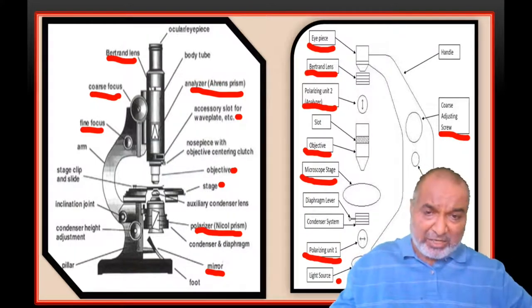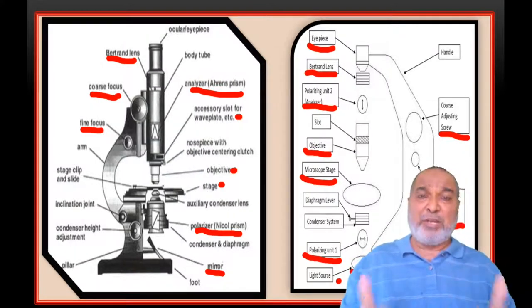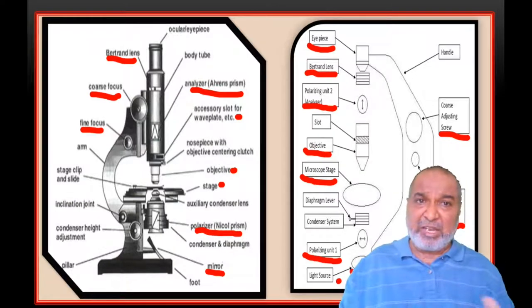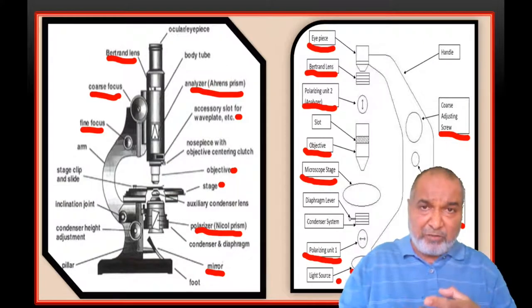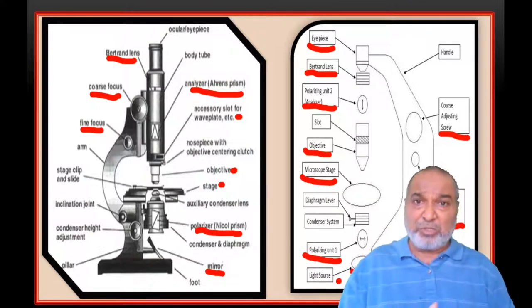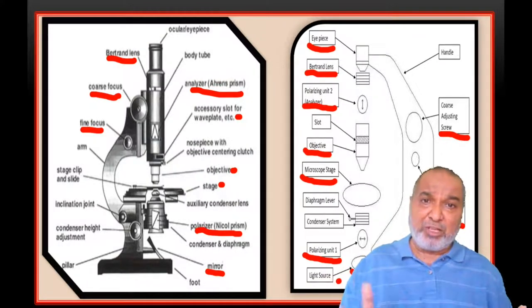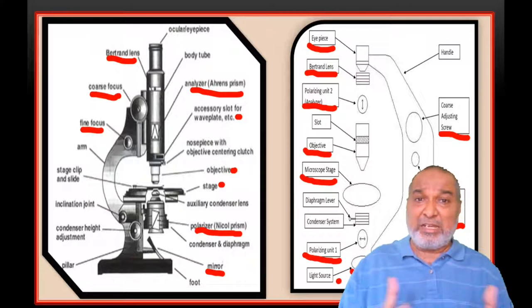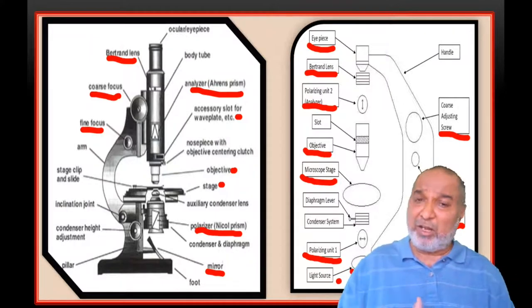You should not touch the two screws below the rotating stage. These are the centering screws, and if you touch them slightly, then whichever mineral we want to study will be off center. To make that centering, unnecessarily 5-10 minutes will go out, and there will be 15-20 students in the practical. It has become difficult; each one is making the same mistake, so we could not study more minerals. We can hardly study one or two minerals.